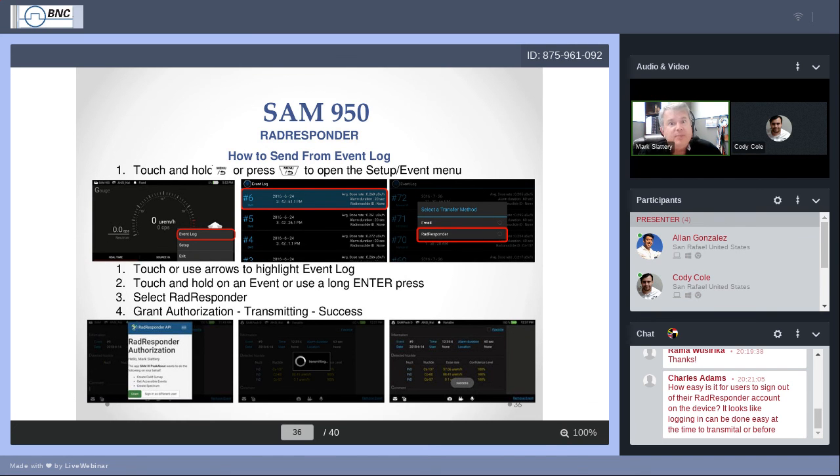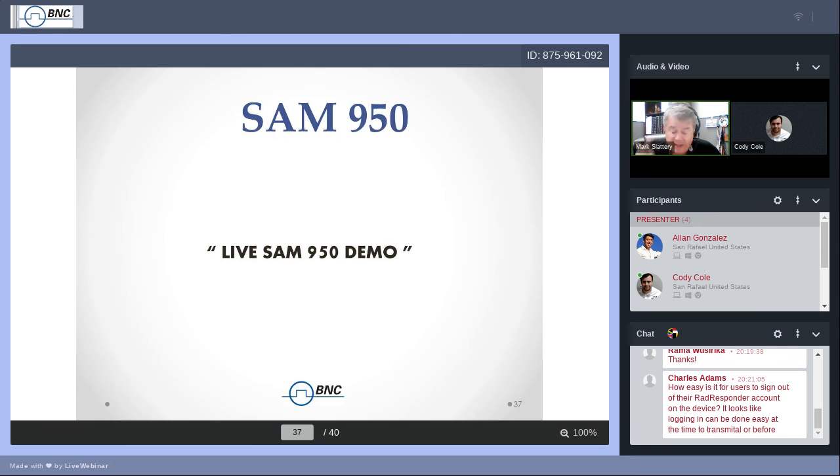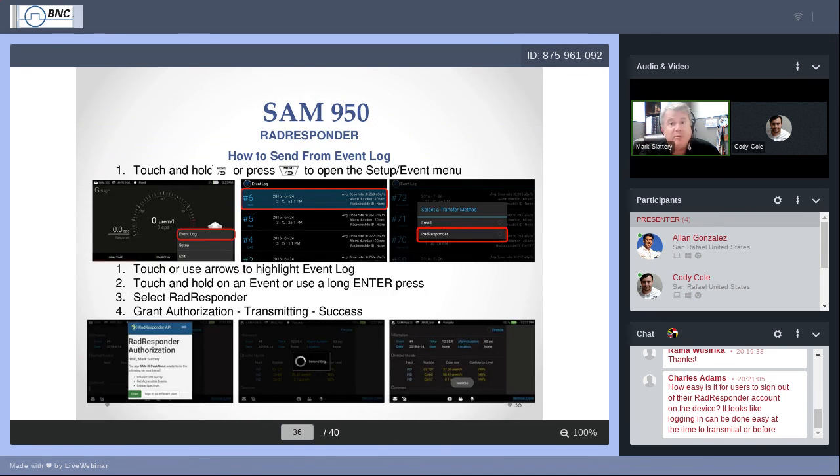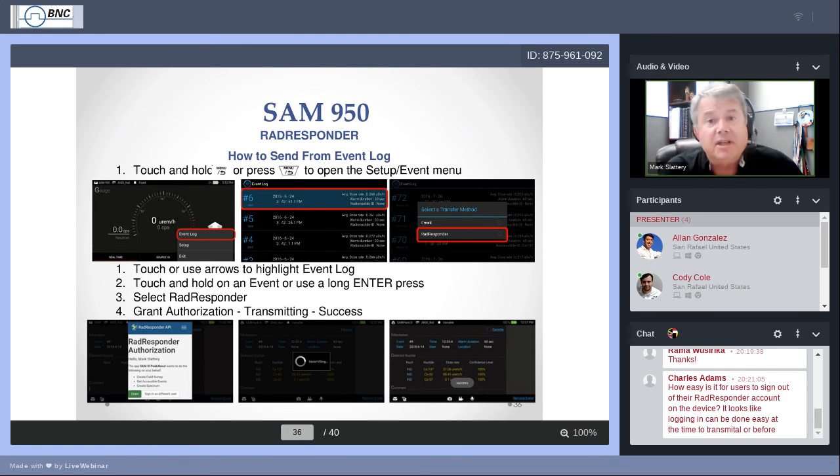We've covered the basics. Again, to get started and get going, you have to do 3 things. You have to turn it on. You have to wait for auto calibration. You have to perform a background. You do those things, and you're ready to search.